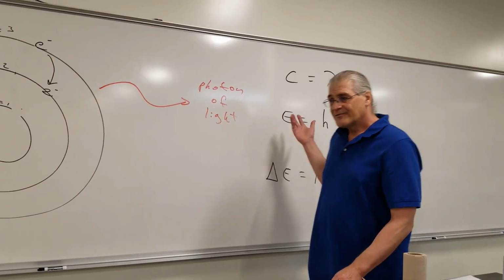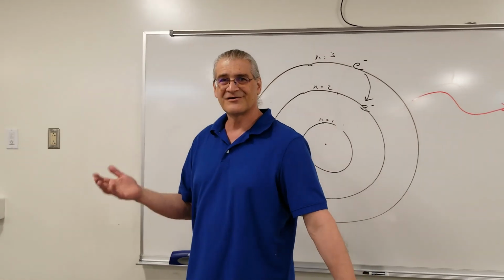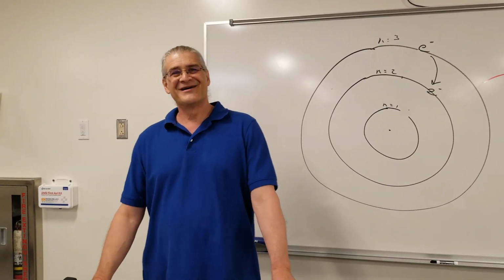So for your lab report, complete the lab report, submit it digitally to your instructor, and that concludes this video demonstration of characterizing elements.